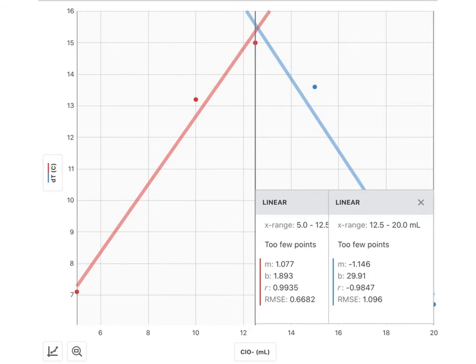Using our experimental data, we were able to determine the maximum delta T that these reactions would result in if all 5 experiments were performed error-free and identically. The two lines would intersect directly over the point in which both of the reactants run out at exactly the same time, the perfect mix stoichiometrically. But due to the introduction of some error, that intersection is a little bit high and a little bit to the right of that point. But that is what our data says is the ideal maximum change in temperature, and so we're going to use that to do the remainder of our calculations.